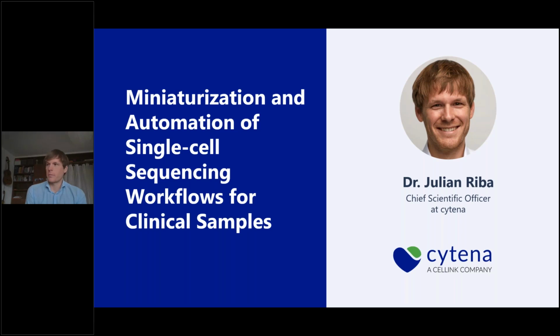In the next 20 minutes, I will introduce you to some of the technologies that we have developed within CELLINK, and I will also run you through a couple of workflows that we established together with partners and customers to analyze single cells from clinical samples.